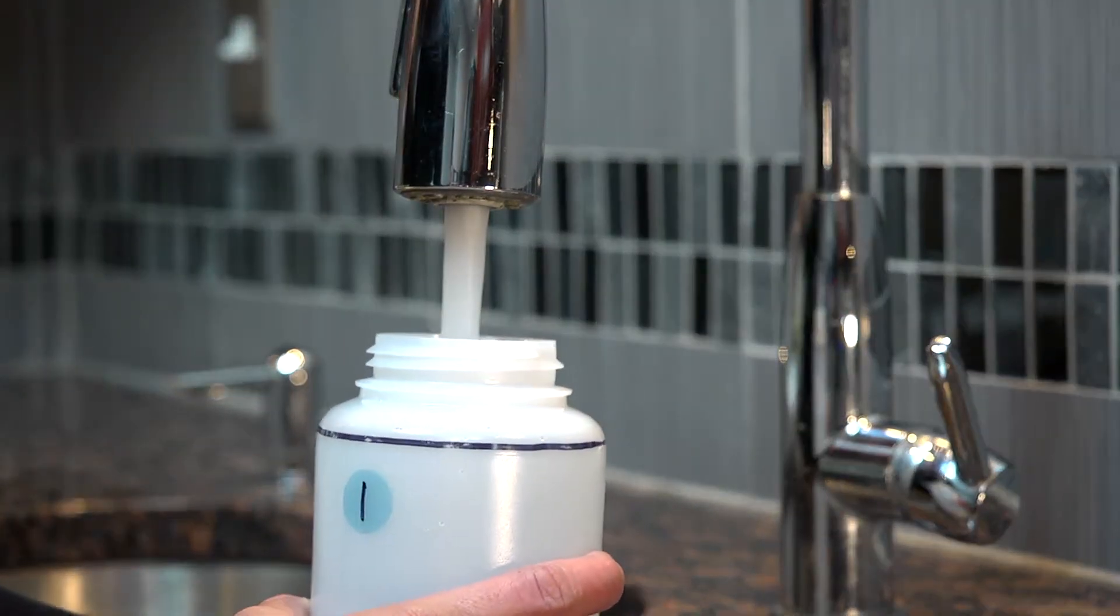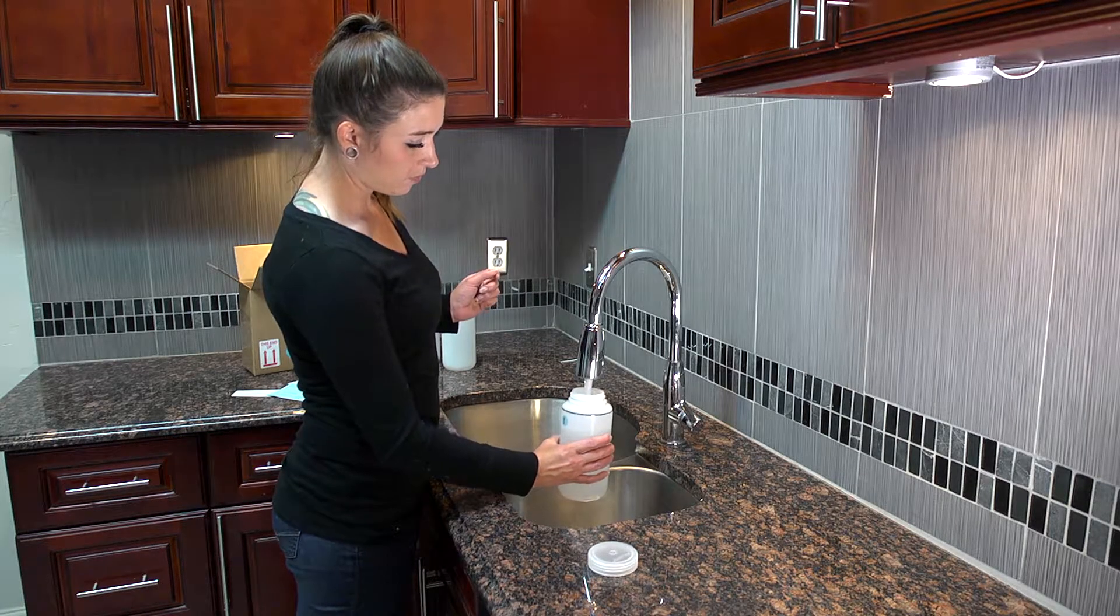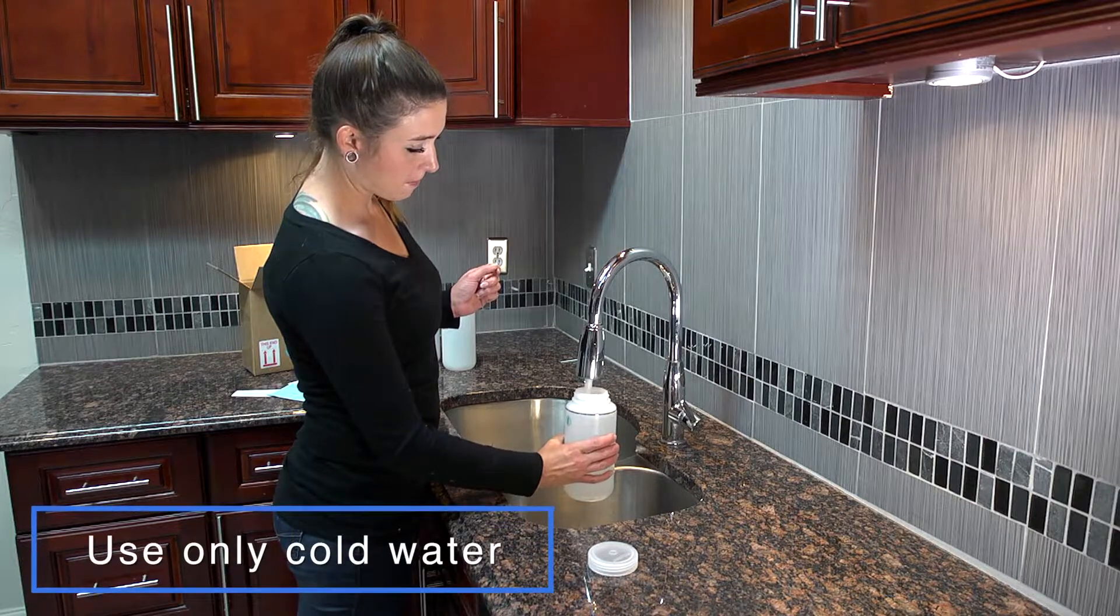Place bottle number one under the faucet. Turn on the cold water and fill the bottle to the black line. Make sure to use only cold water.